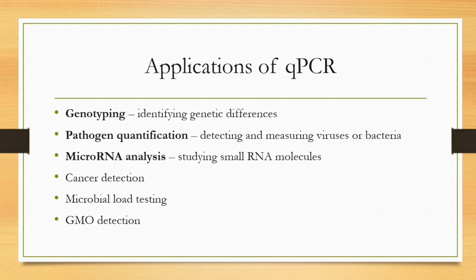Applications of real-time PCR: genotyping, pathogen quantification, microRNA analysis, microbial load testing, GMO detection.